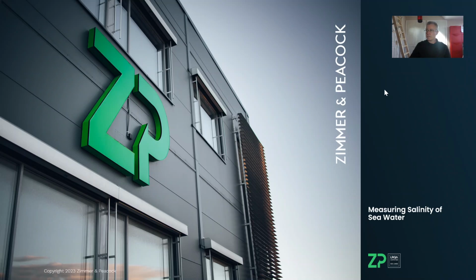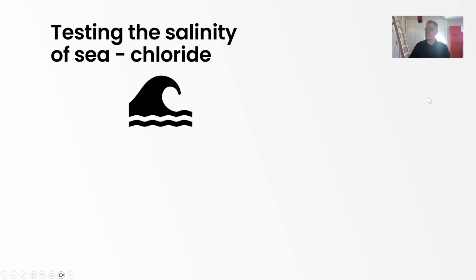Hi, this is just a quick video to discuss ZP chloride sensors for detecting the salinity of seawater. I just want to reach down and grab a bunch of sensors. Now these sensors can be used in a continuous manner or they can be used as discrete measurements. There's a few details behind both of those statements, but in principle they can be.